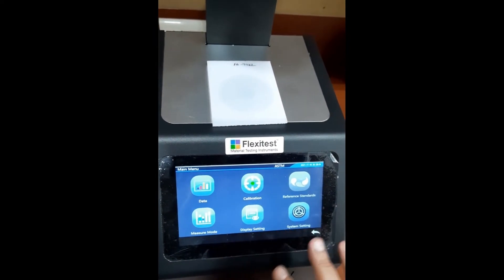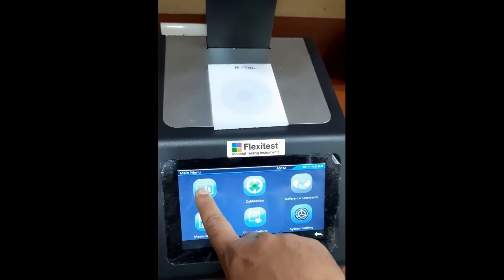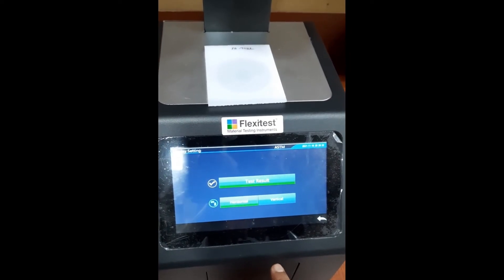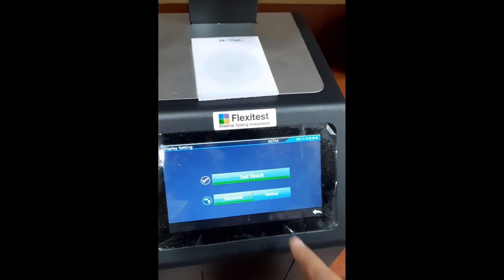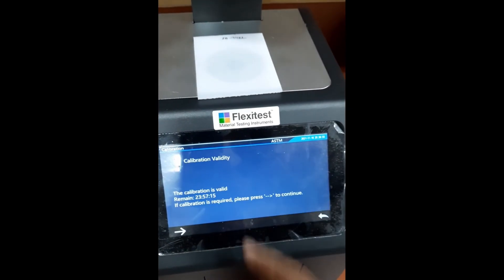This is the display — how the display will look — the data, store data. We can see here this is actually the vertical measurement mode, and if I put the instrument horizontally I need to select horizontally. We can select, and for calibration this is the file.